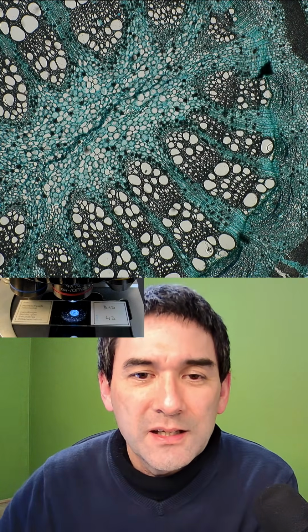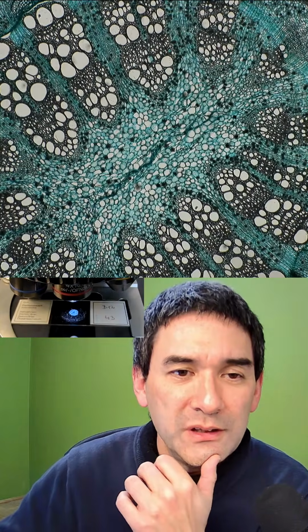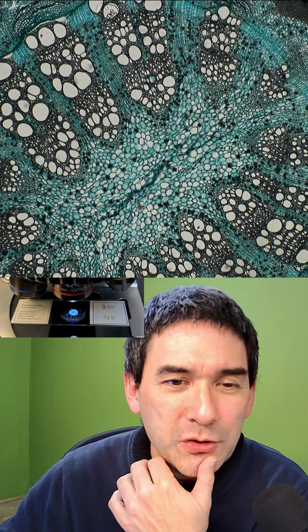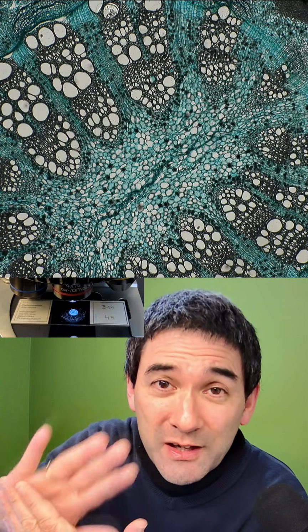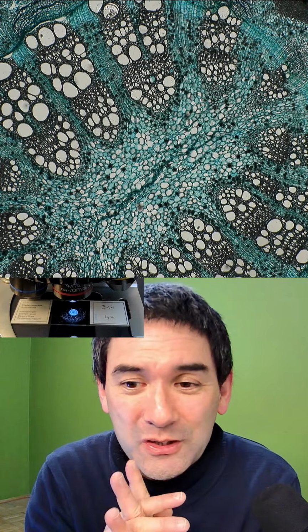Okay, so one of the interesting things I have done here, and I should have actually showed you the picture, is I've taken pictures and inverted the colors, so everything that's white becomes black and vice versa, so it's a negative, right? And this almost looked a little bit like dark field, looks very nice.